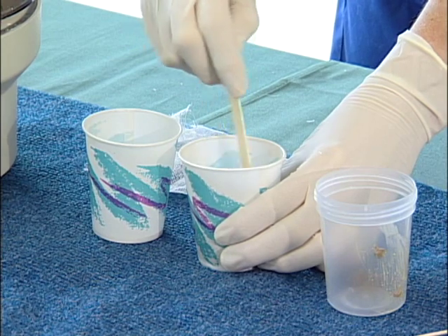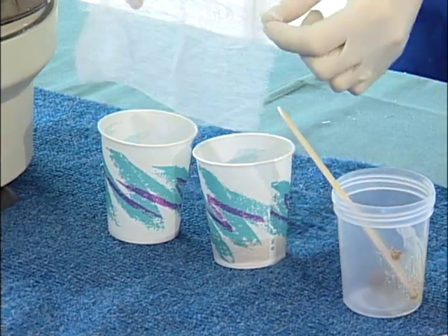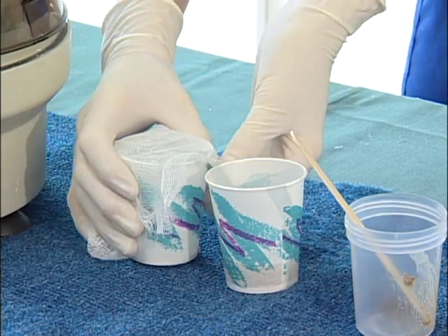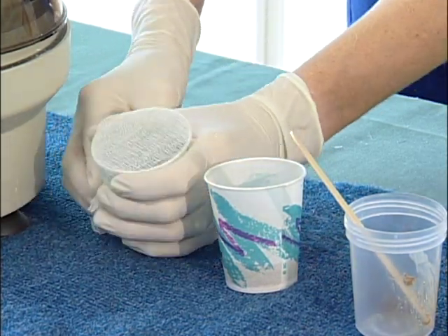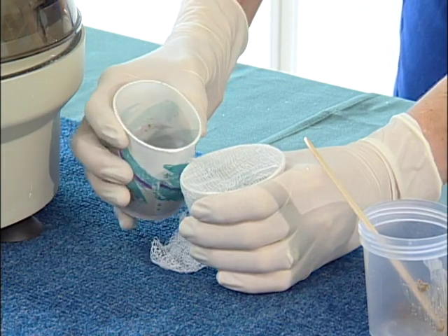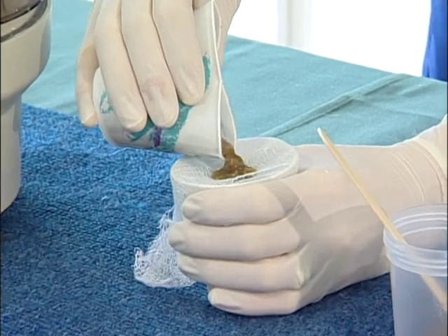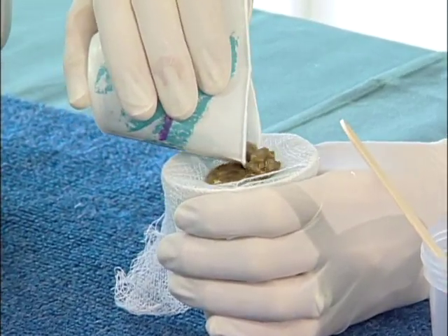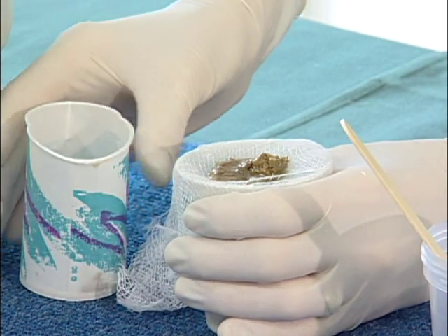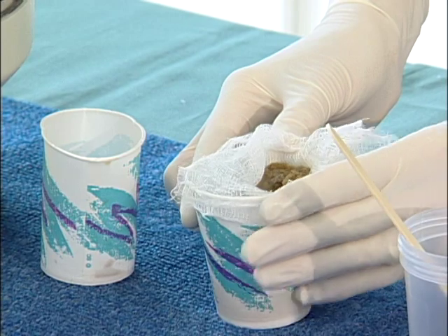Then we are going to filter this. We are going to use either a 3x3 or a 4x4 gauze that has been cut down. Place this over your dixie cup — use paper dixie cups as the filtration process is a little bit easier. Create a divot with your finger and carefully pour the fecal solution into your other cup, straining it. Then place the gauze into your other cup carefully.